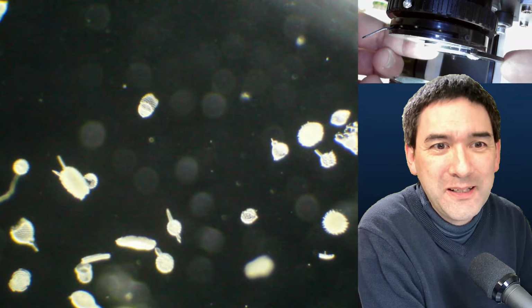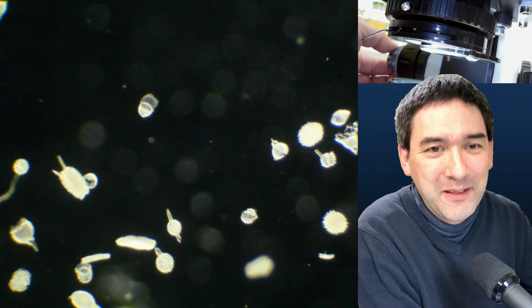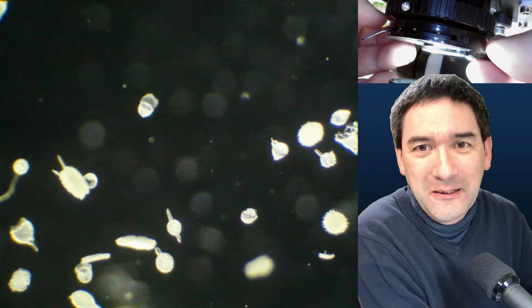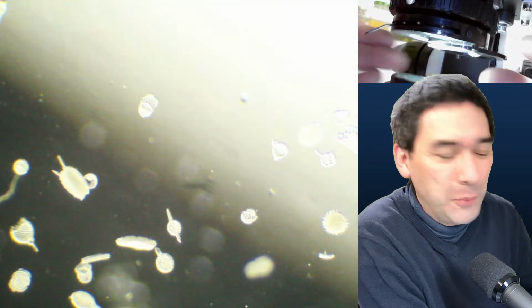By the way, there's another funny thing here. I've now removed the filter. Look what happens, because of the plastic holder itself of the filter holder. Look, it's completely empty now. Okay, you see, it's empty. But even the plastic itself actually works like a dark field. It's kind of funny. You don't even need a dark field filter. If you just use the empty holder, and switch it over like this, you're right on the border. You're actually getting a little bit of oblique illumination.